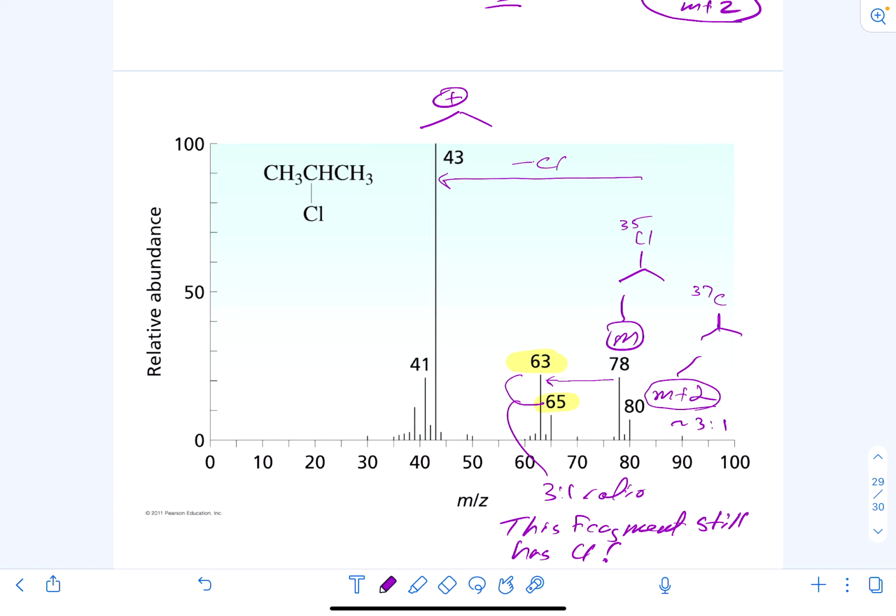Okay, so we can learn a little bit about the structure just by looking carefully at the fragment. I see only one major peak up here, the base peak at 43, so I know I've lost the chlorine in that case. That corresponds to a loss of 35 mass units. Also, if I look at these two down here, I can tell right away that I still have chlorine in there. So what does this fragment look like?